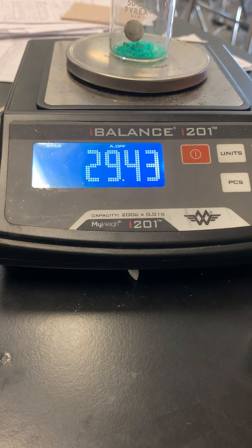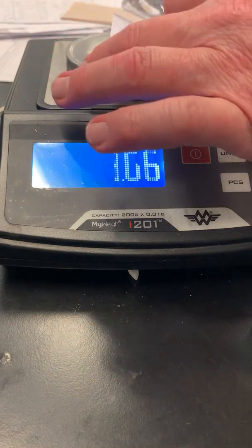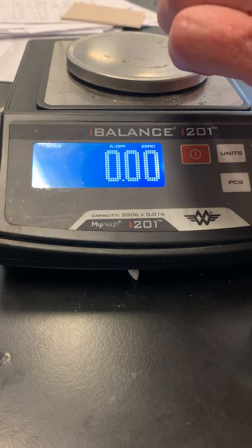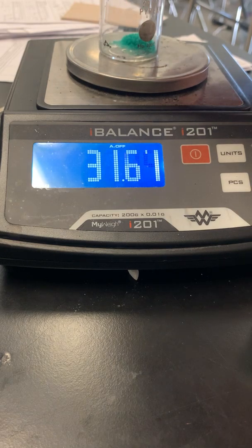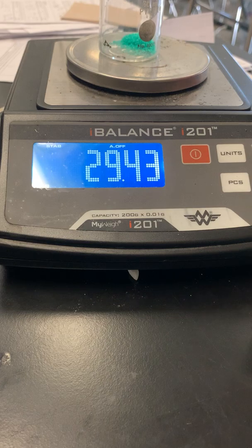We can fix this. Okay. So my mass at the beginning, 28.43. My mass after I add stuff, 29.43. Somehow I got exactly 1 gram in there.